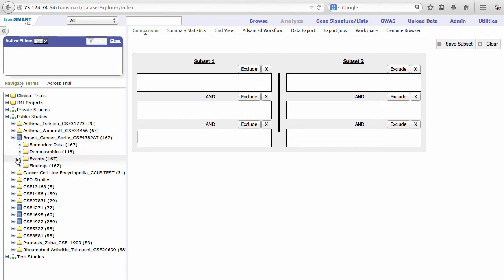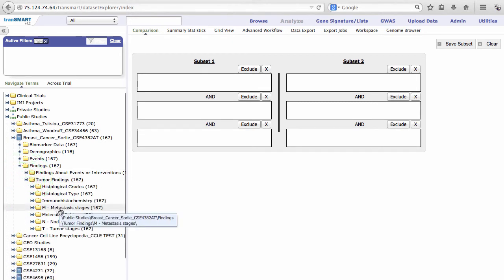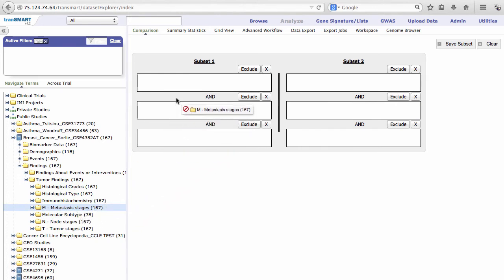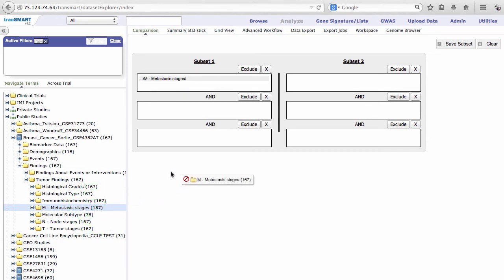Expand the Findings folder. Expand the Tumor Findings folder, then drag and drop the Metastasis Stages folder into the first box under Subset 1 and into the first box under Subset 2.